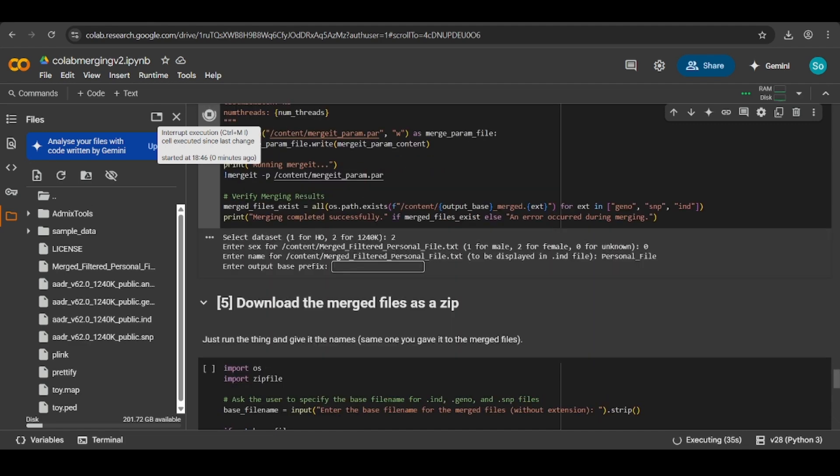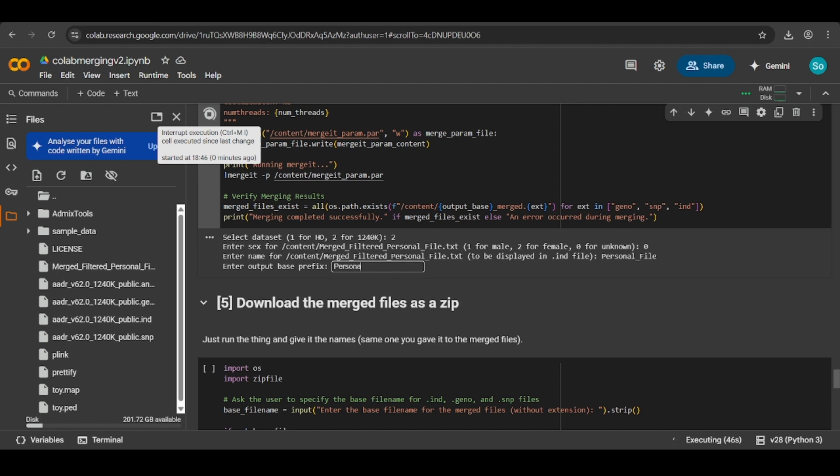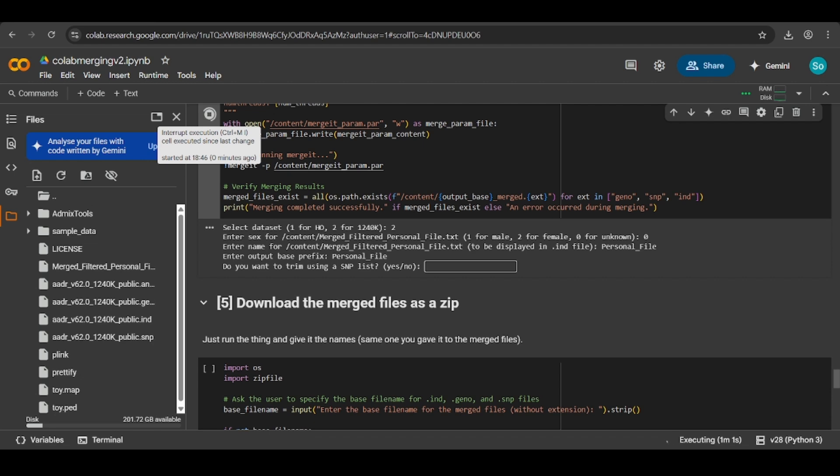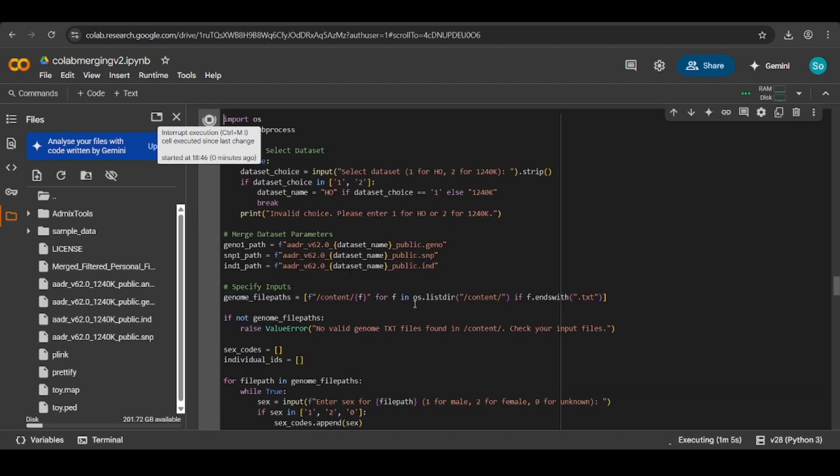Enter this. The prefix will be the name of the actual files themselves. You want to just call this personal file. It's fine, but remember this because you'll need it later. Then finally, it will ask you if you want to trim using the SNP list. Here, click no because the P-link SNP lists are quite buggy. They don't work properly, and we already did this in the last video manually. So put no and then click and hit enter.